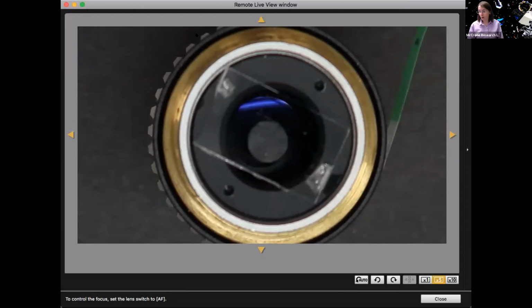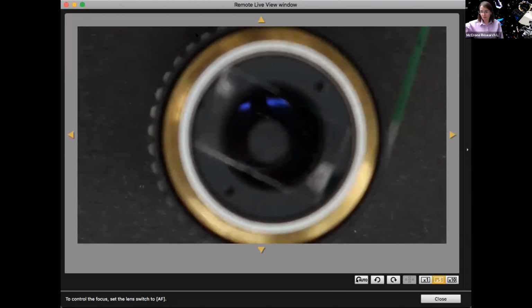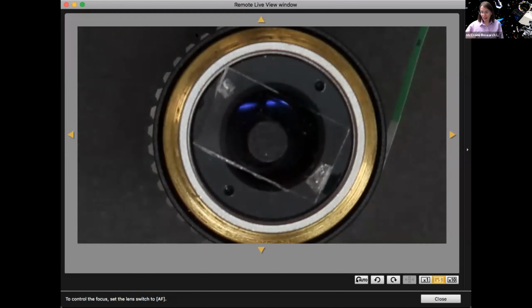with a square one as well. So if you didn't have a round one, I was able to cut that down and fit it inside the barrel. I rolled up some tape there, and that seemed to work. I think the circular ones are better, but really in a pinch, you could use one of those as well.